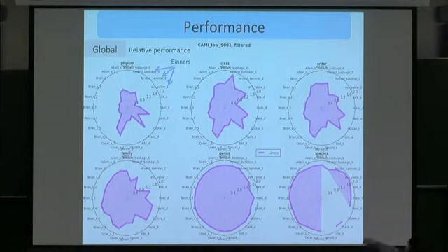Once again, at the genus level, everybody is uniformly doing poorly, but then some of them, like modest Babbage 5, with a different parameter setting, do much better. Not better than the best of the others; at the order level, Ed does better, Frank does worse, and modest Babbage is somewhere in the middle for this sample, for this error metric.